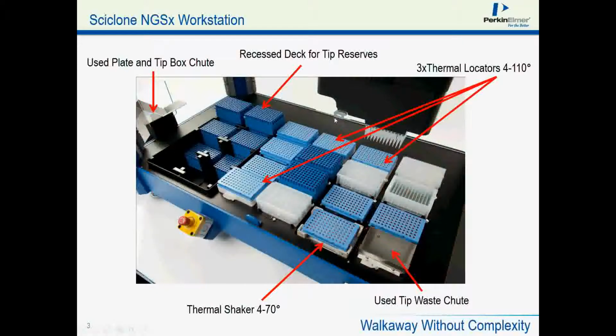There is also a gripper. This is the main head that we use to do our pipetting. But on the left side, in this little section, there's a robotic gripper that can come down at various heights and basically grip plates, tip boxes, and lids. It's a very valuable tool in this particular setup. And over here, where you may see tips hanging, these are 96 tips, and if we wanted to do a full plate transfer, we could do a full plate transfer.